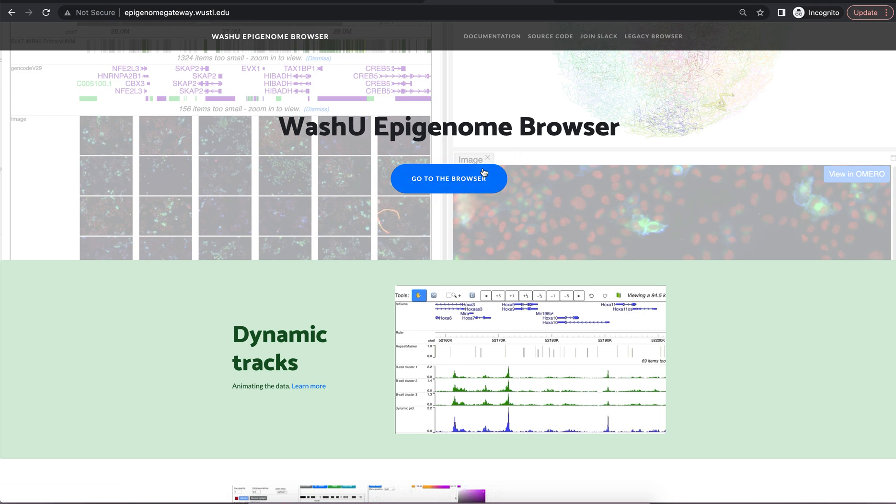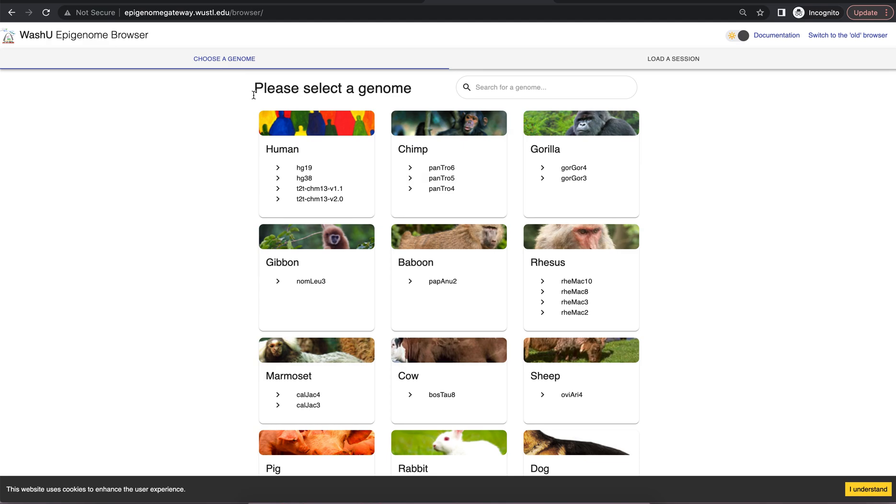To navigate to the browser, click go to the browser. Here it will load a page where you can select the species and reference assembly of interest.